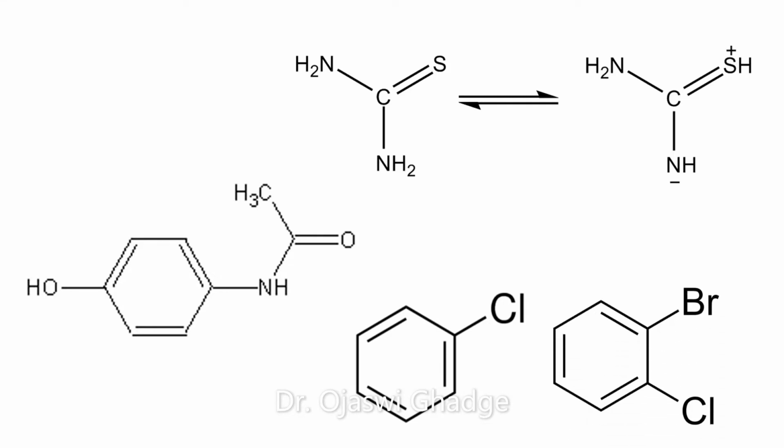What I said just now is that I don't know which structure the compound given to me has. There are so many structures which can be formed by using these covalent bonds between the two elements.